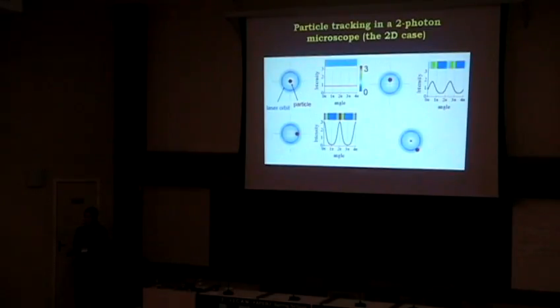Now, remember that small volume, that is our observation volume, and that can be scanned, right? So imagine now that, well, that volume, the characteristic of that volume is that at the center of the volume, fluorescence intensity is the highest. At the periphery of the volume, fluorescence intensity is lower. So imagine we can make an orbit with our volume that is half the size, meaning the center of the excitation volume is here at this line, this circle, and this is the periphery of the volume. Now imagine that our fluorescent particle is right at the center of this orbit. What we will see, our fluorescent signal will be always the same because it's stopped there. We are making this orbit and taking data, so the fluorescence data will be always the same.